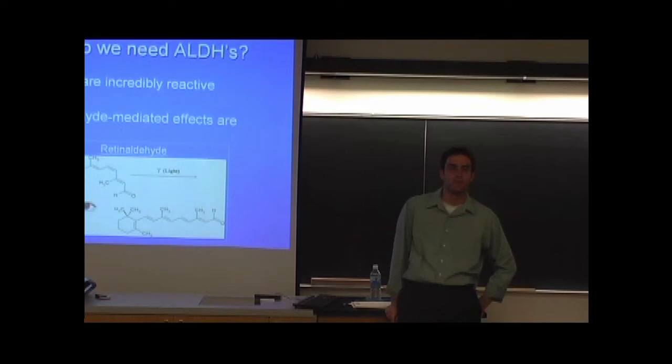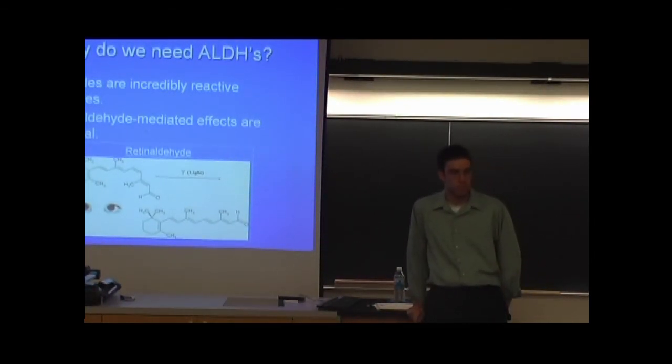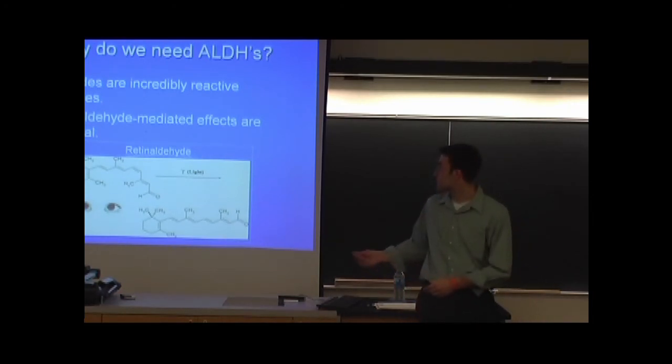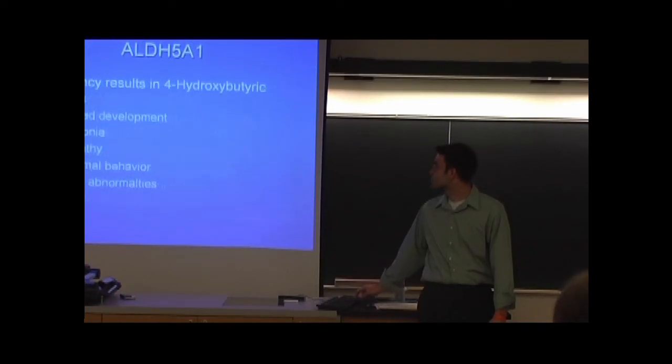Any other questions? I have another one. On the GeneJET versus Omega kits, I know they don't tell you what's in the reagents you're adding. But were the sequence of steps the same? Roughly.